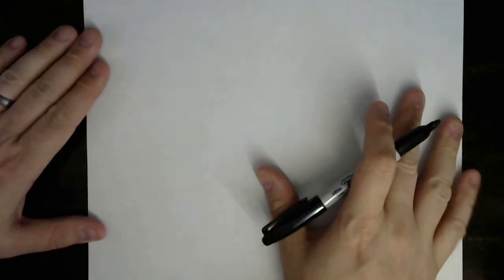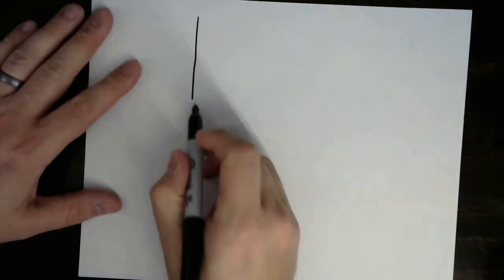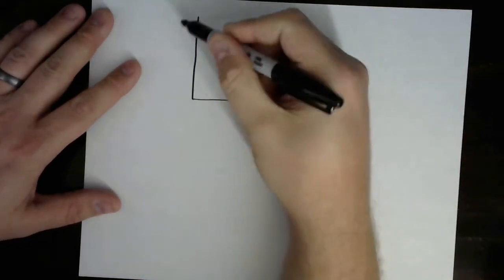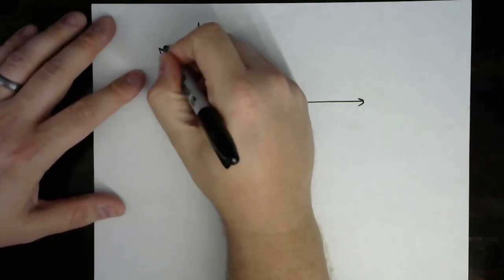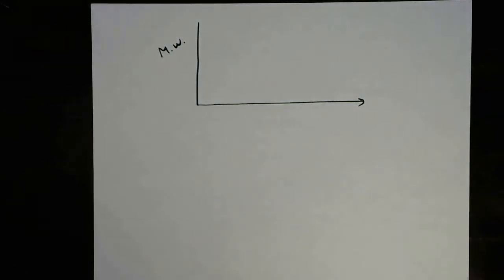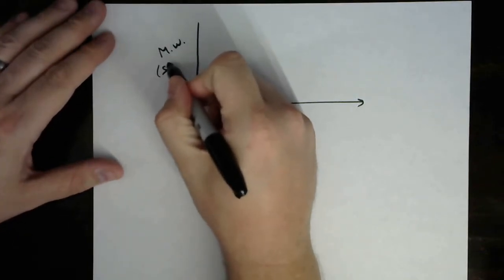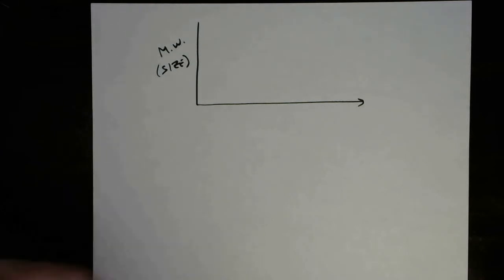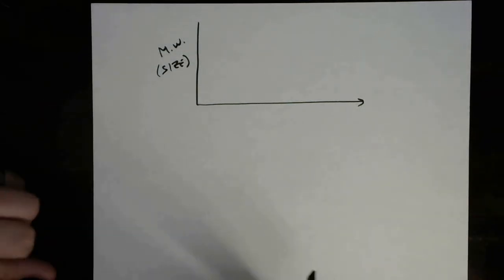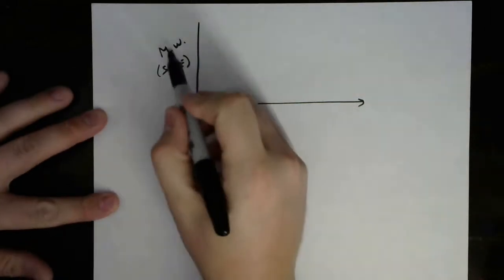Okay, so let's take a look at the space that we're resolving in here. So we'll call this y-axis. To be honest with you, we generally think of this as molecular weight, although any polymer chemists will tell us that molecular weight is not directly a stand-in for size. You can have something that's very heavy and very compact, and you can also have something that's very light, but also diffuse, right? Low density, and so it would have a very large particle size. So the real thing we care about here is size.